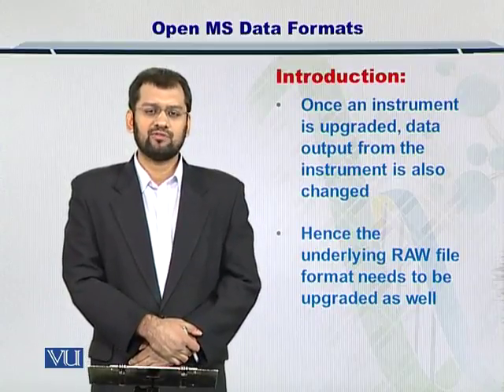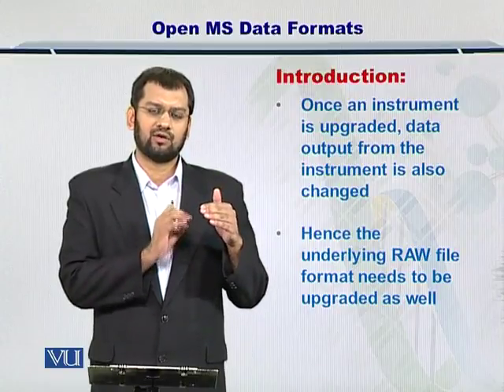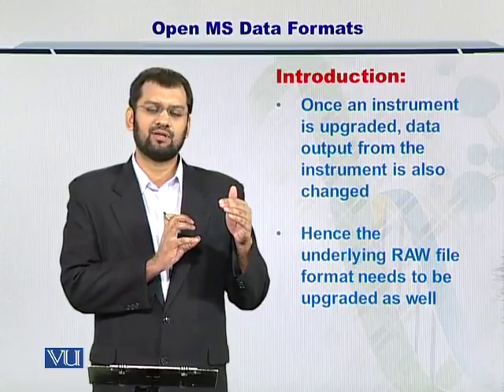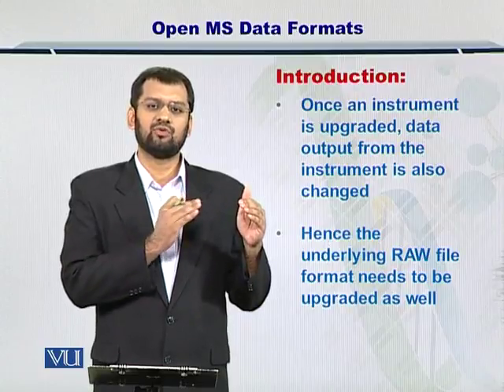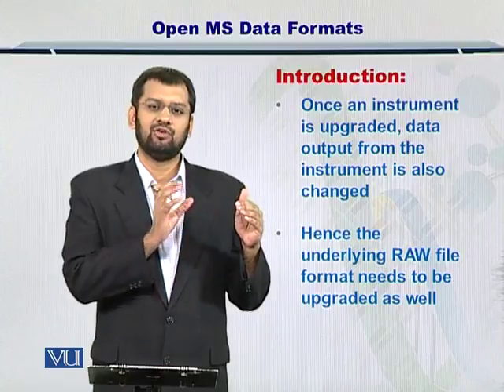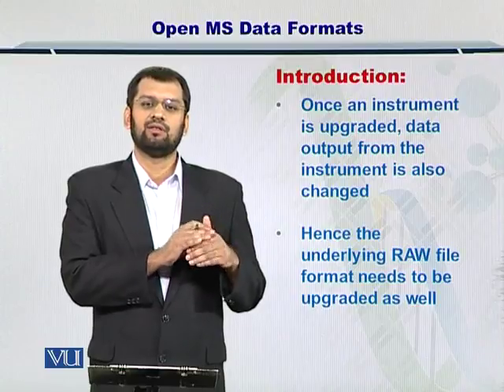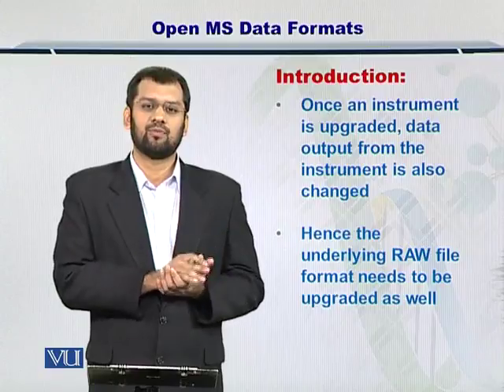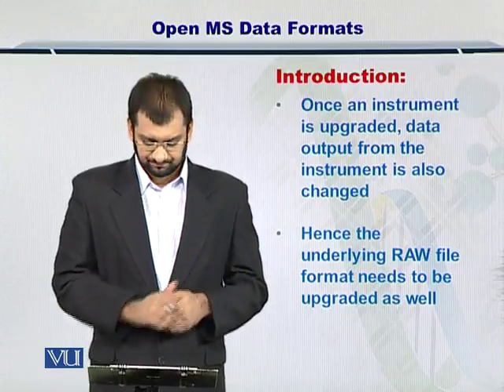More so, once a mass spectrometry instrument gets upgraded, the raw file format that was there for the previous instrument no longer remains valid. So if you have written software to read the raw file format of the previous instrument, your software will no longer work with the new version of the instrument. This is another motivation to have an open data format, in order for your software code to be working all the time.